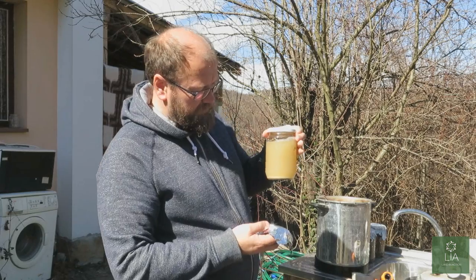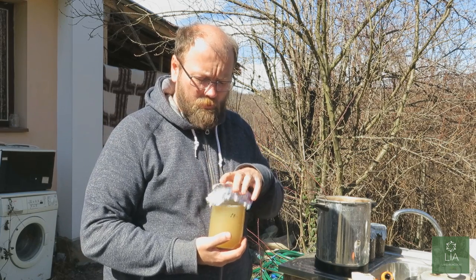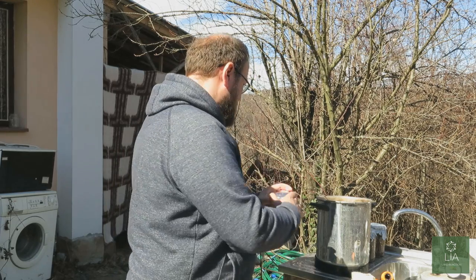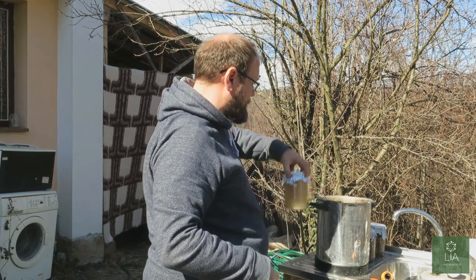Okay, so here we are outside with the pressure cooker. We're going to put a foil cap over the jar just to prevent any water from dripping back down into the jar while it's in the pressure cooker. The pressure cooker is already warming. It won't take so long.